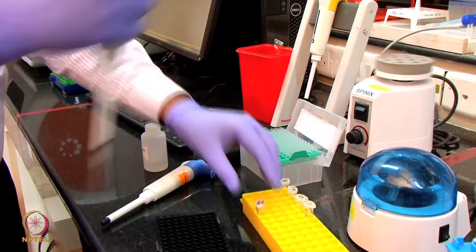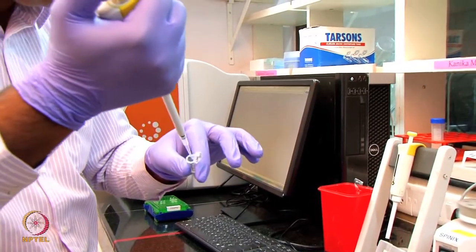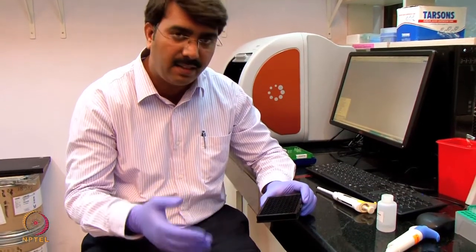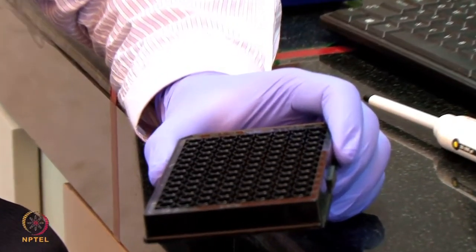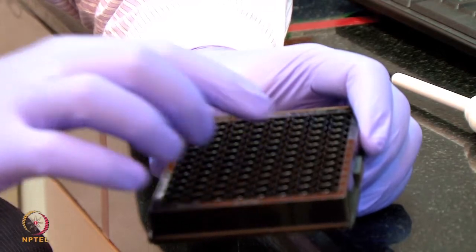Here, this is the 50 microgram per ml protein. I'm serially diluting, doing a two-fold dilution in the plate. So now we have made 6 concentrations of the standard apolipoprotein, with a concentration range from 1.56 to 50 microgram per ml. I had put these standards, the 1.56 in A3 through A8, that is the last 50 microgram per ml, as well as a reference buffer, the buffer we are using for the reference subtraction, at B6, B7 and B8.